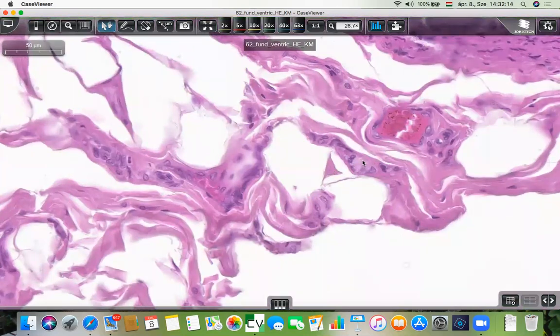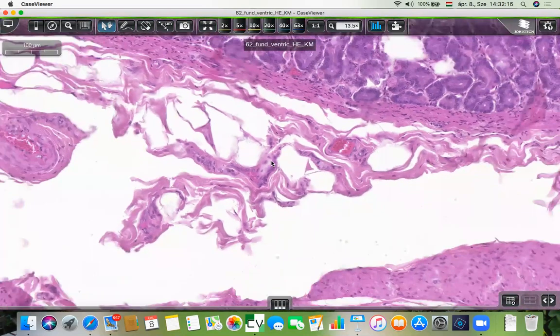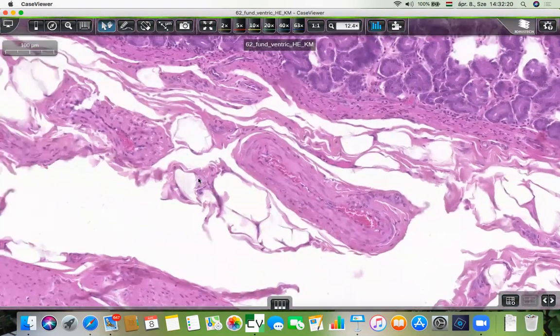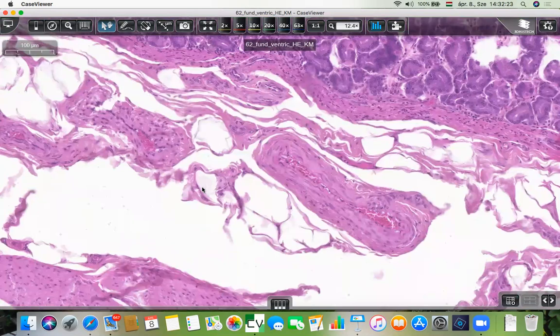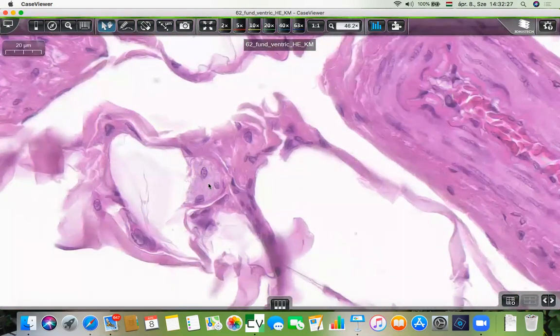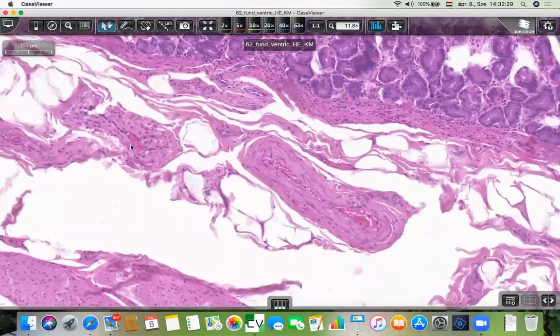These are also, but I can see the ganglionic cell. The number of the Meissner plexus is much fewer than the myenteric. That's the reason why we can see it's partly just half of the myenteric is presented.